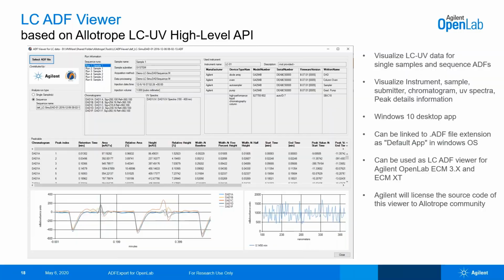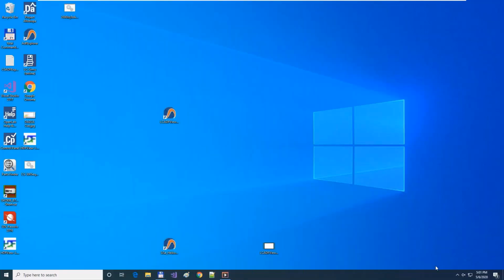Yeah, so it has some basic capabilities to zoom in. That application uses basic Windows UI controls, no sophisticated scientific chart controls, but it's possible to do a basic zoom in. But I don't know if that satisfies your need.